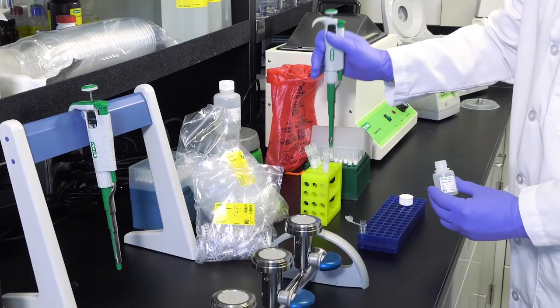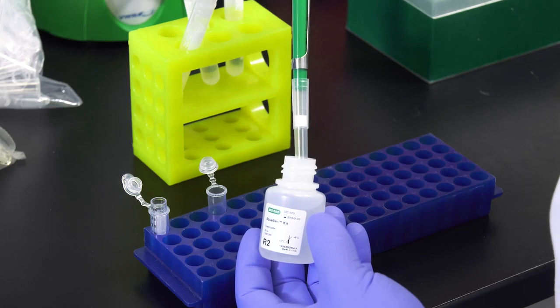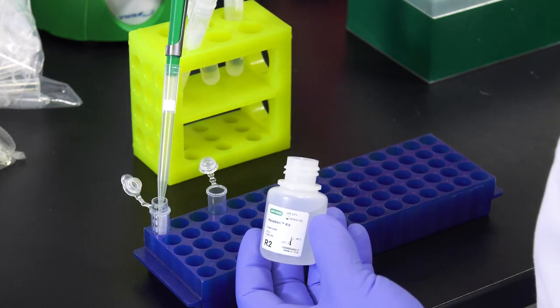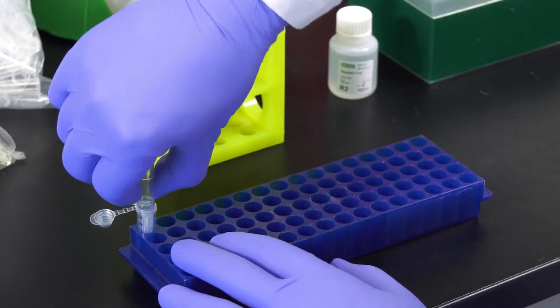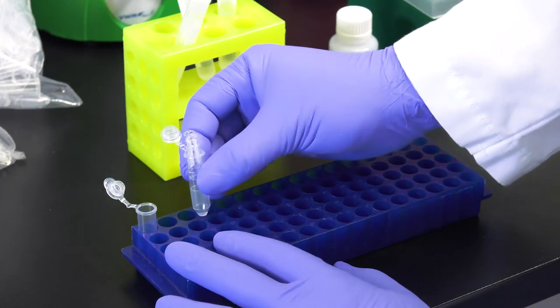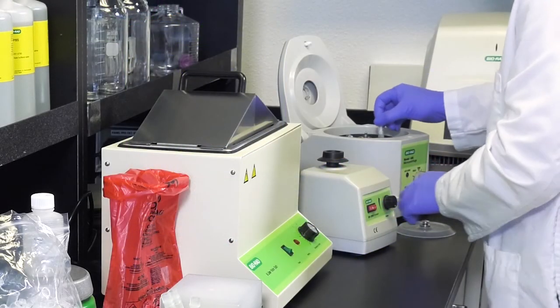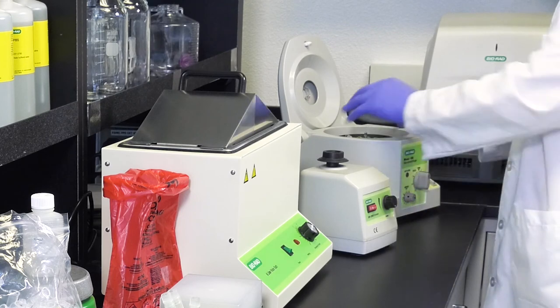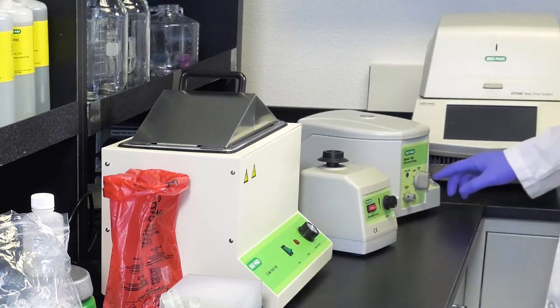The next step is to elute the DNA from the column. To do this, add 100 microliters of R2 solution to the purification column and throw away the collector tube. Cover the purification column with a clean collector tube and turn the whole thing upside down, transferring the column to a new tube. Centrifuge for three minutes at 1000 times G and then throw away the purification column. Note that the cap cannot be closed in this step.